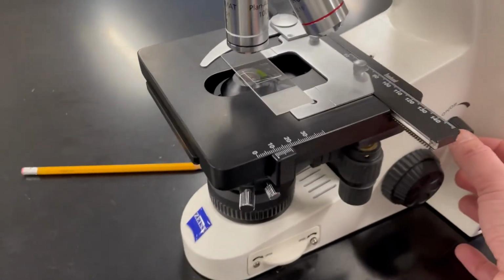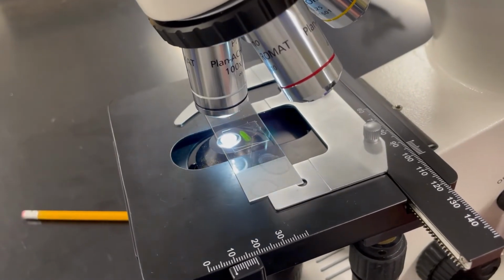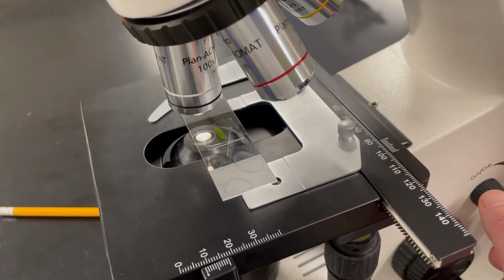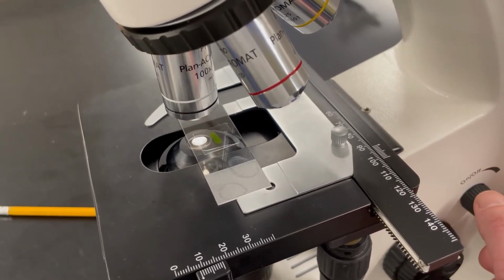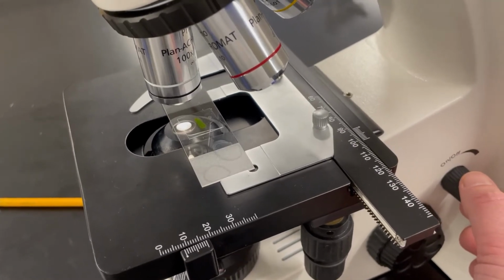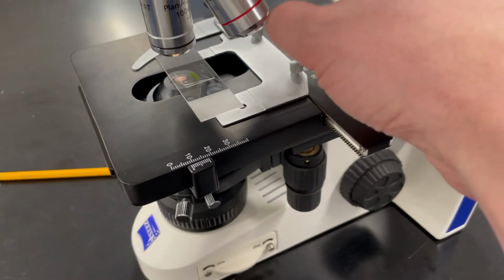If I take a look at the actual specimen, you can see the light is getting bright or dim. And it's really just a matter of preference in terms of what you want to see your specimen best at. Sometimes with the larger lenses, you need a lot more light. With the smaller lenses, you need a lot less.